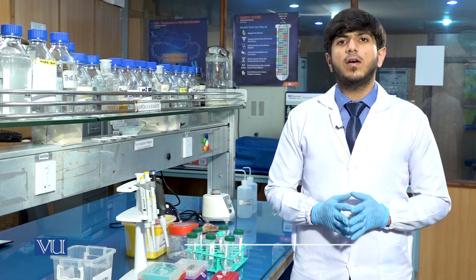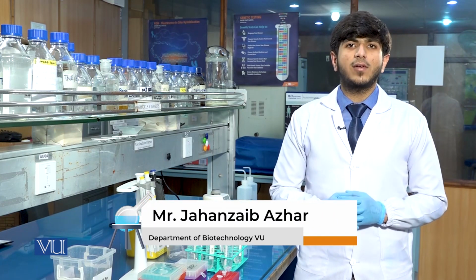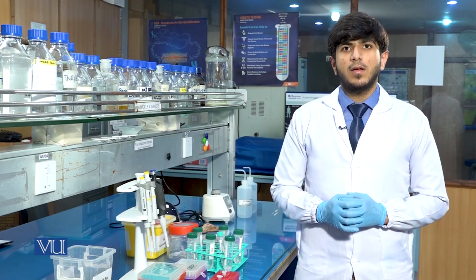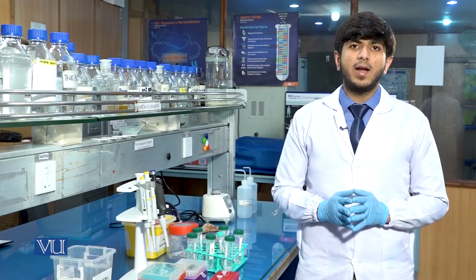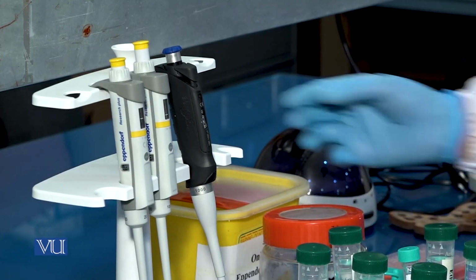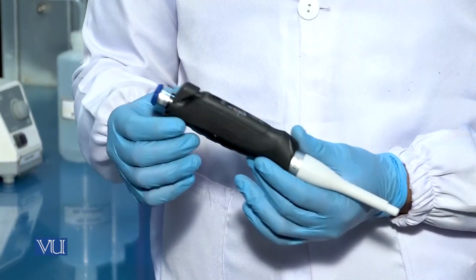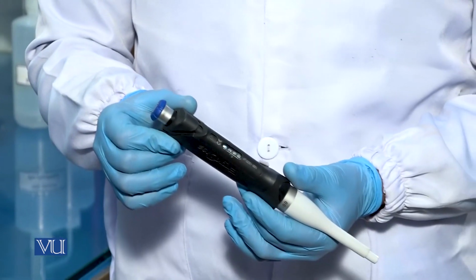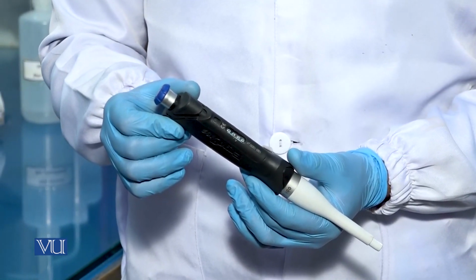After the addition of 80 microliter SDS, we will add 250 microliter of buffer A1, which will be used to stabilize the DNA at the required pH. We will take a pipette of range 100 to 1000 microliter and will set it on 250 microliter in order to add the buffer A1 in the solution.